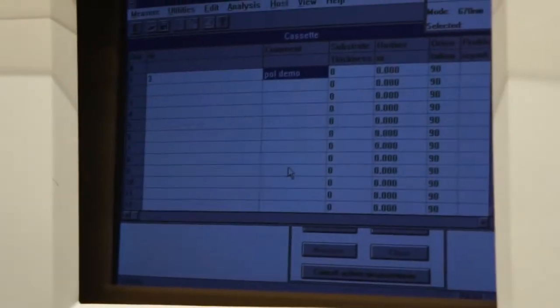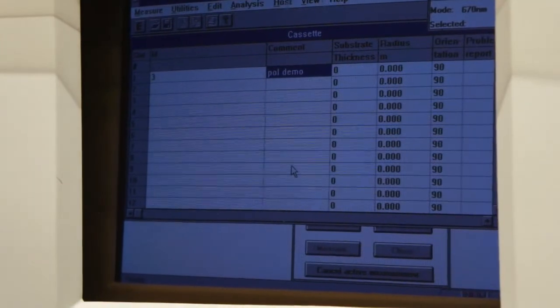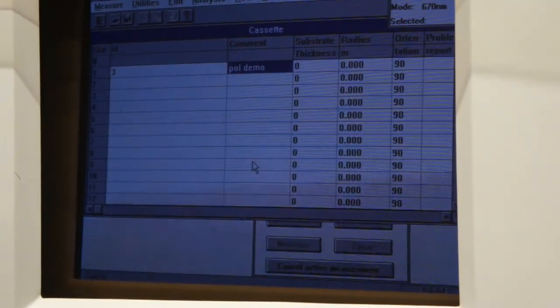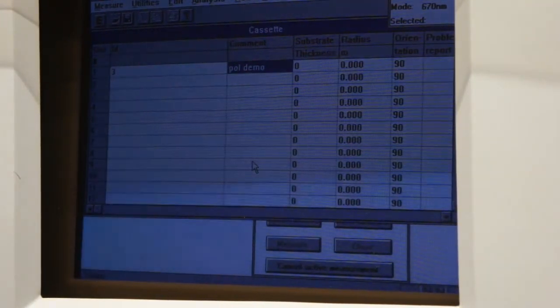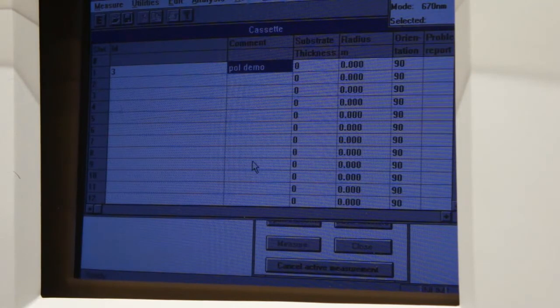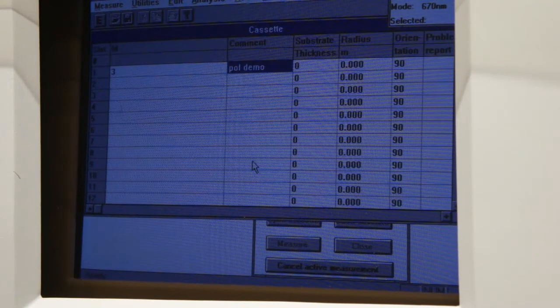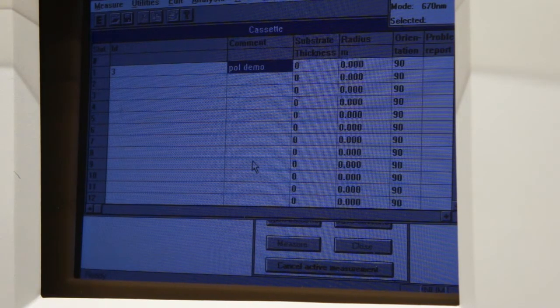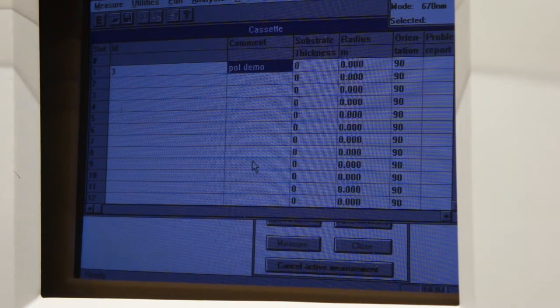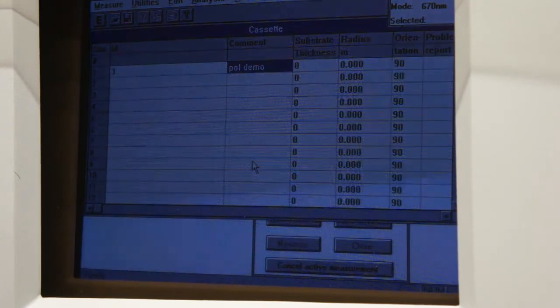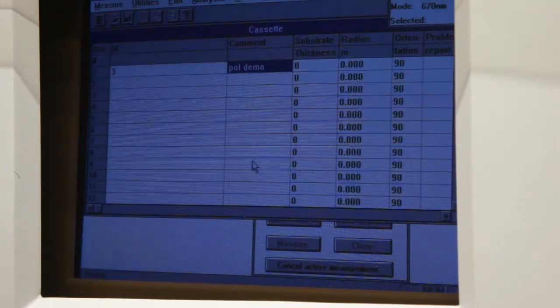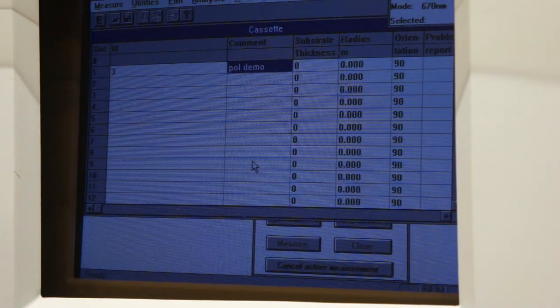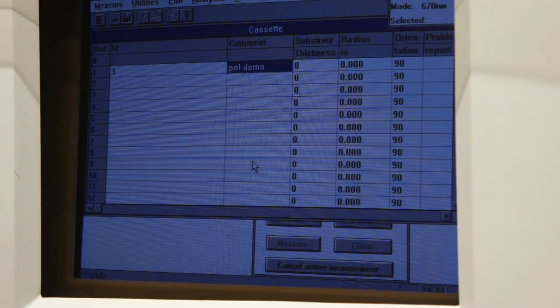Let's take another scale measurement, you can hear that, it's pulling that now, it's loading onto the stage, going to the pre-alignment, going on a tripod, it's kind of hard to go back and forth so let's just keep it on the screen. You can hear things running.